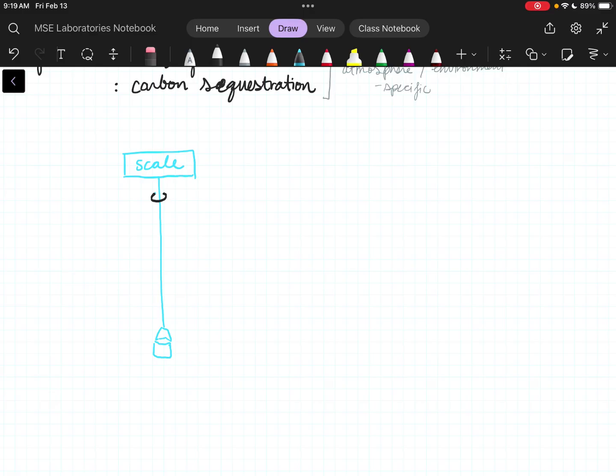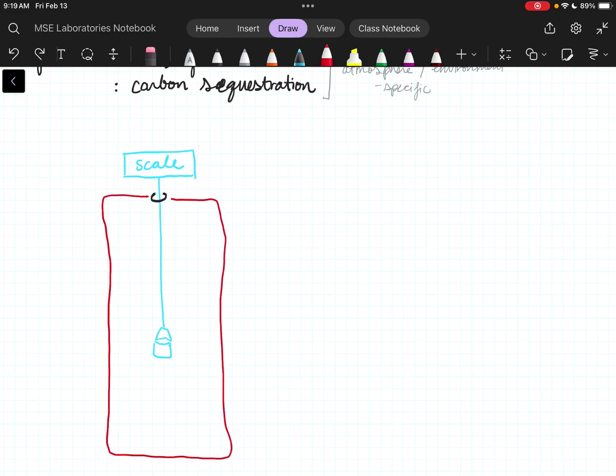It's got a big long bar hanging off of it, and then we hook this little bucket, really a very small bucket, usually around the size of a hole punch as its footprint. You could go bigger if you wanted to, but often we don't need that much mass to be able to read things properly.